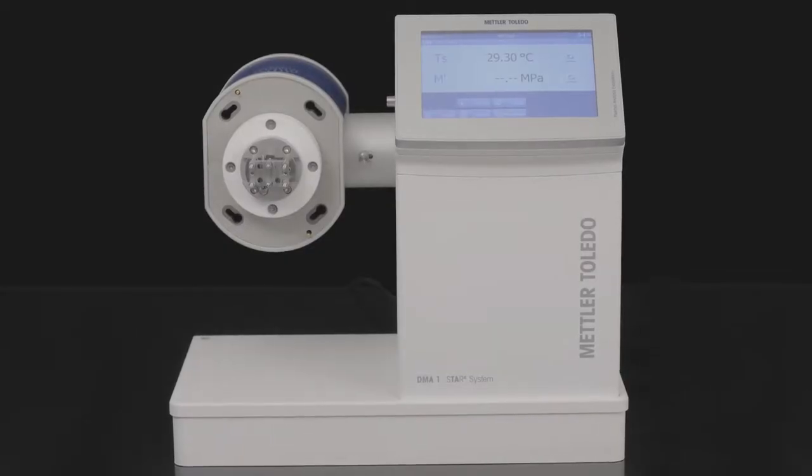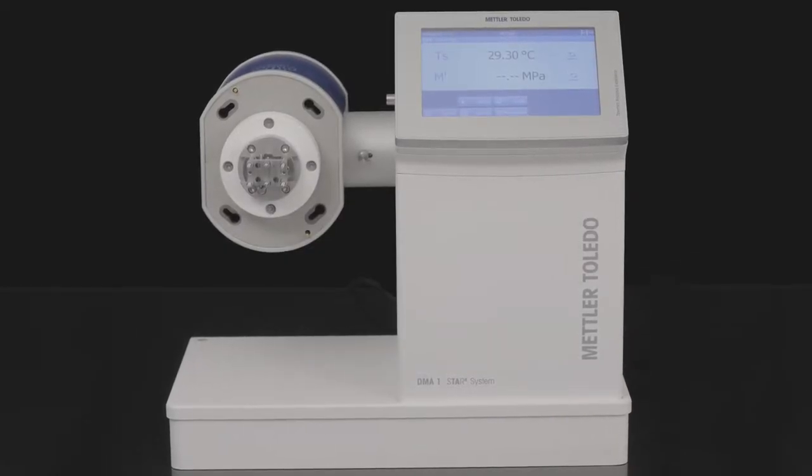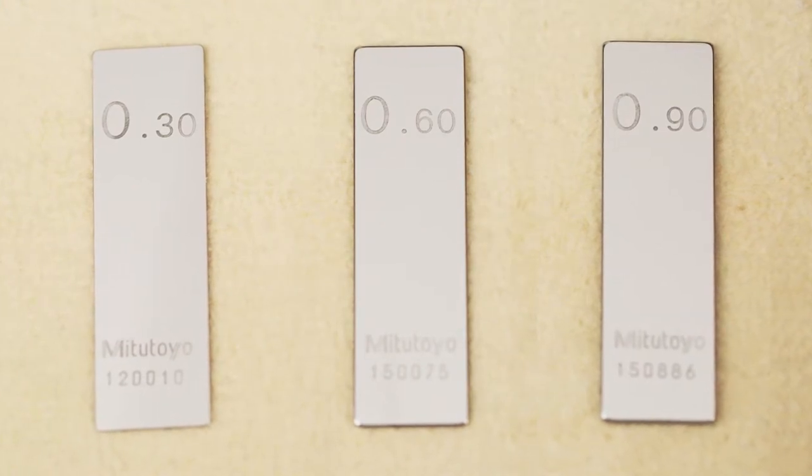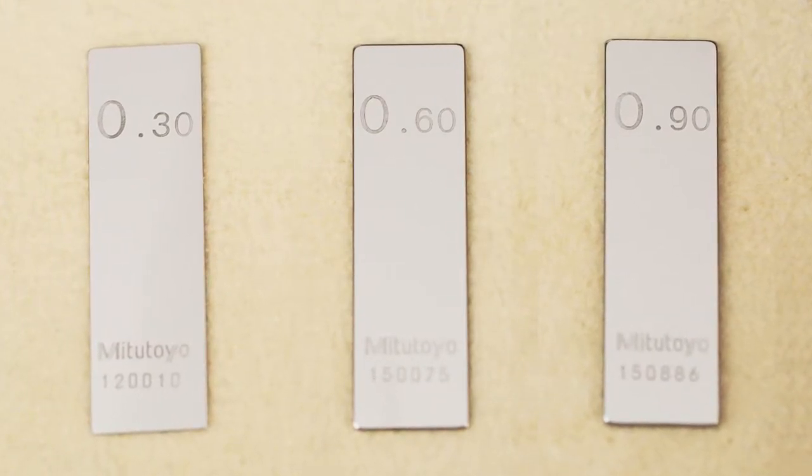The displacement adjustment is based on the measurement of length differences. It is performed by interchanging gauge blocks. It is highly recommended to perform the displacement calibration with certified gauges. These are available from Mettler Toledo as an accessory to the DMA1.